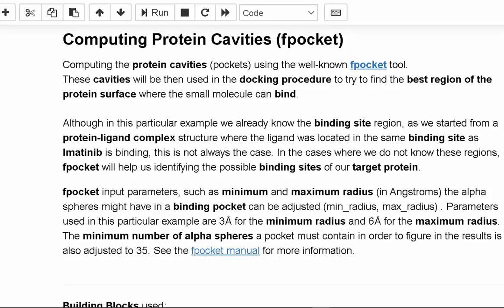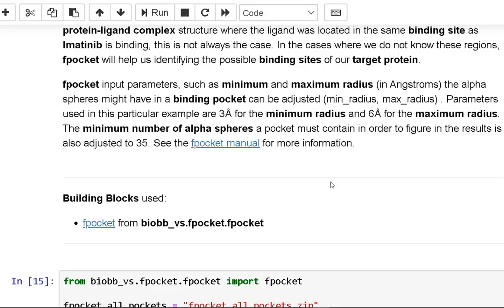If we don't know these locations, FPocket can help us figure out where our target protein might bind. The lowest and maximum radius that alpha spheres can have in a binding pocket can be modified using the FPocket input parameters. In this example, the minimum radius is 3 angstroms and the maximum radius is 6 angstroms. The minimum number of alpha spheres required for a pocket to be included in the result has been increased to 35.